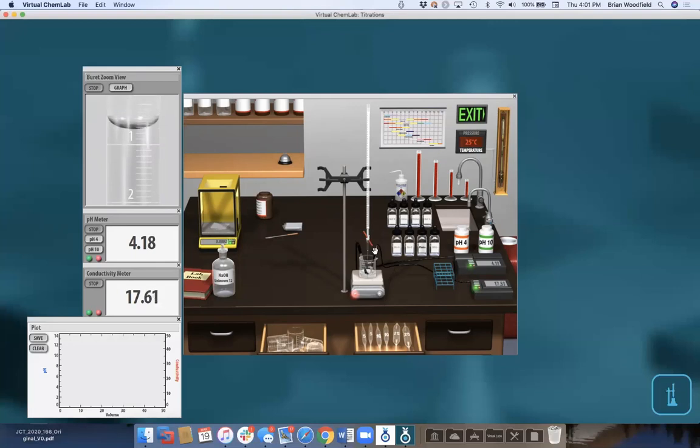And I can start this titration. As it goes, we're saving this. They can save this to their lab books as well. I'm saving data. You can slow this down to different rates. We'll just go fast, get this over with, so you can see the endpoint. But this is a titration.